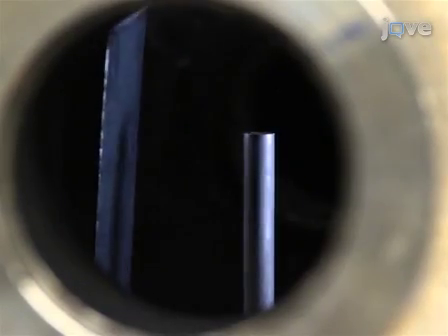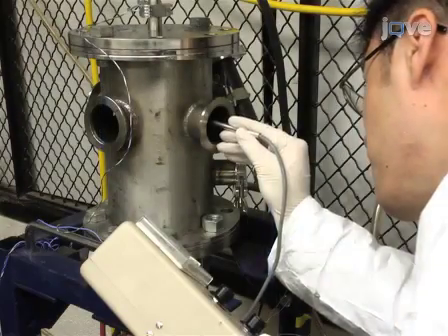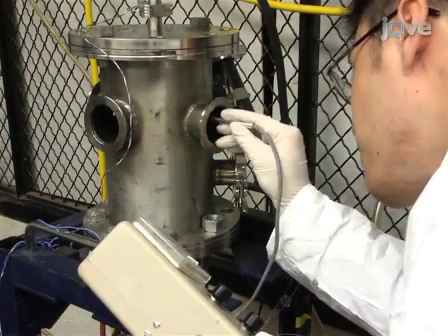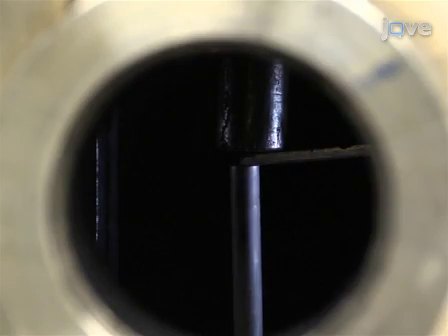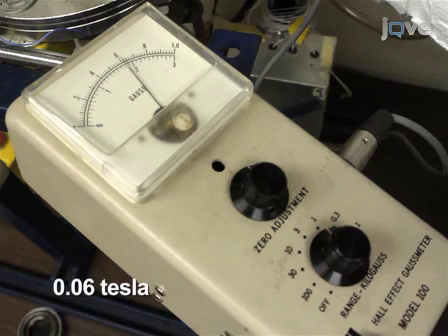Attach the molybdenum sheet to one side of the permanent magnet and turn this side towards the electrodes. Using a gauss meter, measure the magnetic field in the inter-electrode gap. Keep the average magnetic field between the electrodes at about 0.06 tesla.